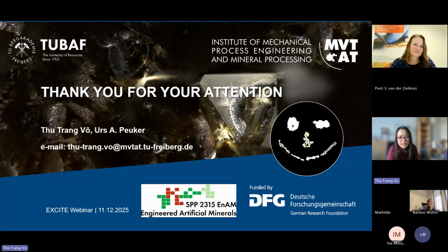And all the others, usually you need a better laptop, or they are just really bad in their results. I'm really confident with Elastic if you don't want to create your own segmentation algorithm.